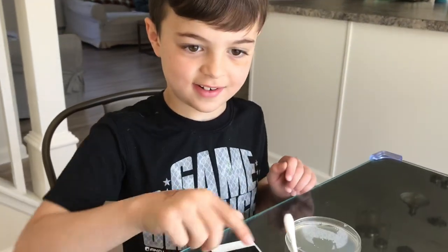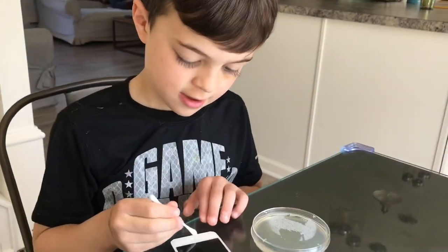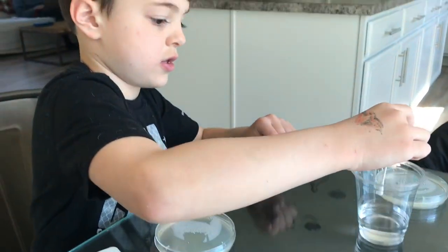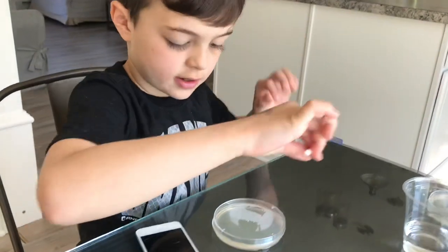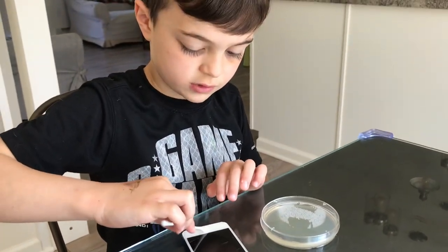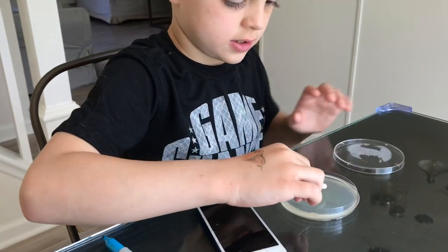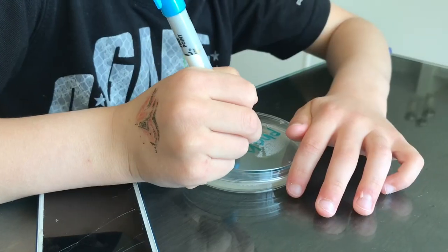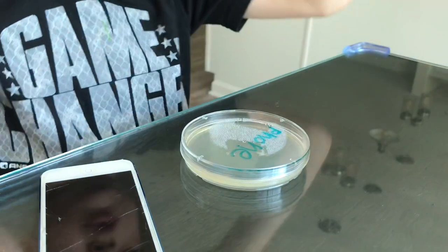What's your second pick? Phone. Okay. Gotta dip it into the water. Now I'm gonna swab the thing because that's what you always turn on the phone. Okay, now you labeled the second one. Put that aside.